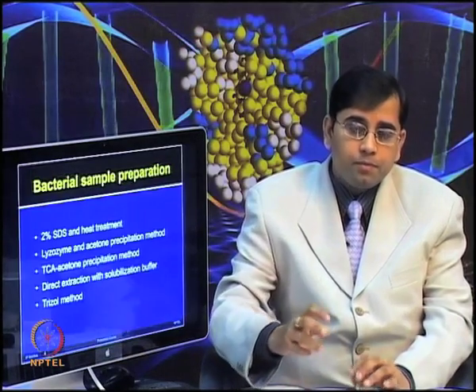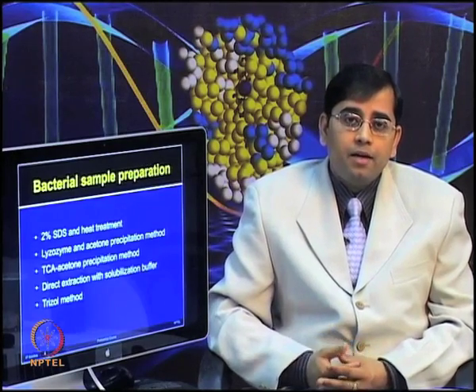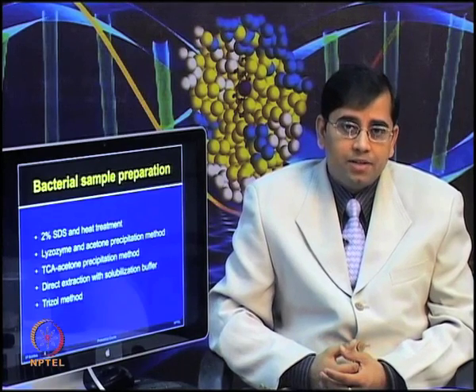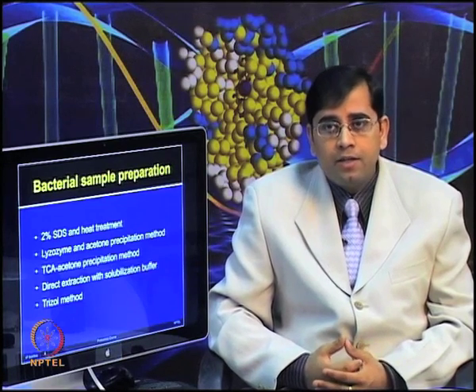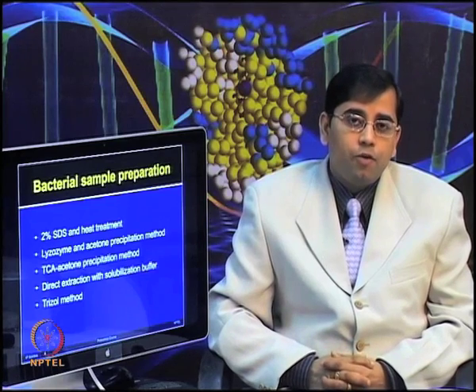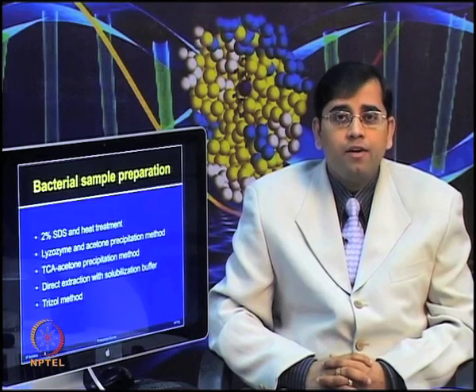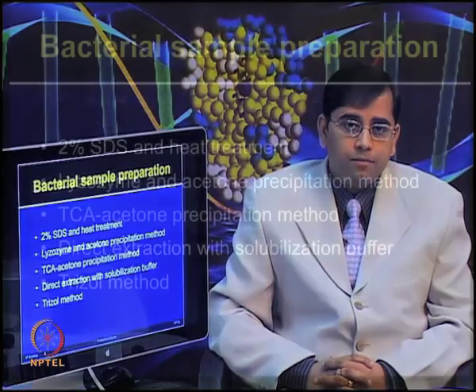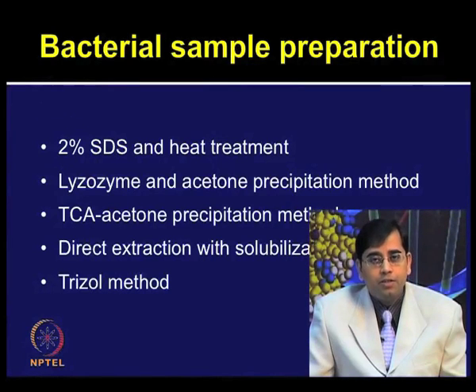Now let us elaborate on this and look at different sample preparation strategies which people apply for bacterial protein extraction. These are all reported methods available in the literature. I have just compiled them for your brief overview. For the detailed protocol of each, you can refer to the detailed publications. So, 2% SDS and heat treatment has been applied for bacterial sample preparation. Similarly, lysozyme and acetone precipitation methods have been used.